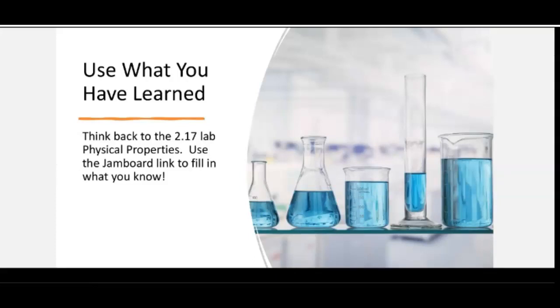For the oxygen splint test, if you look at the screen in the Jamboard, and if any of you just came in, it looks like our numbers went up. Take a look at screen 2, look at the picture there, and what observations are you able to make based on the flaming splint reacting with oxygen gas?